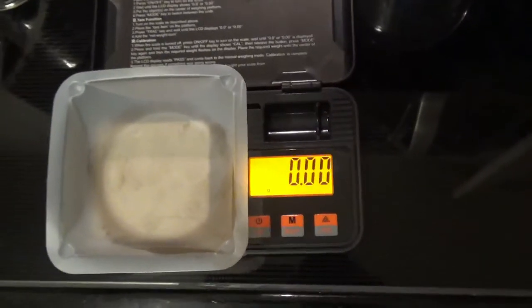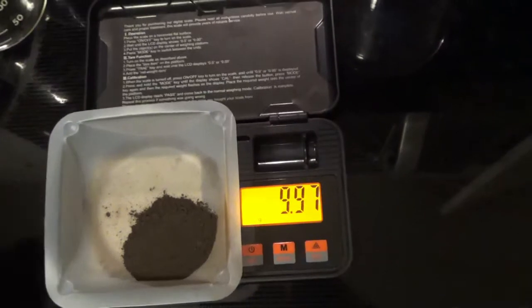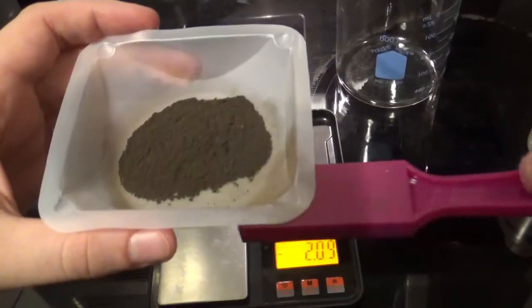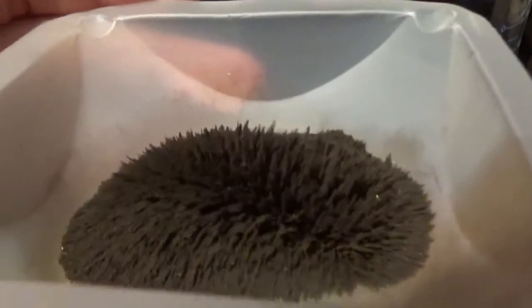For the first demonstration, I took 10 grams of iron filings, which is a nice fine powder that is dark brown, almost looks black. Then I took a magnet and put it underneath the iron.